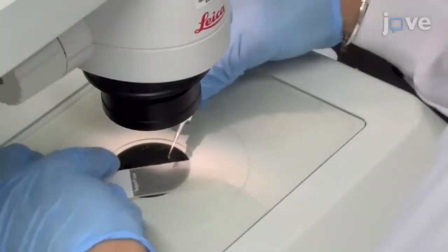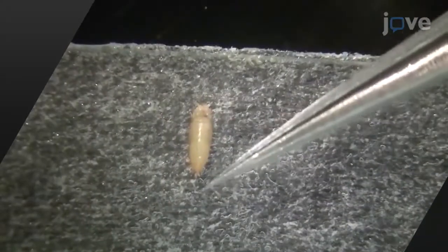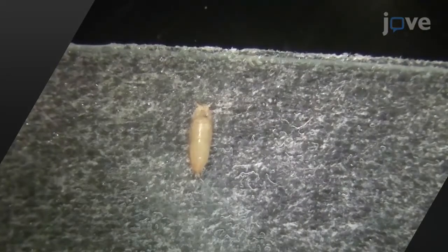Glue the ventral side of each pupa on a glass slide covered with double-sided sticky tape. Gently tap on the head spiracles and the dorsal surface of the pupa with the tips of the forceps to assure the adhesion of the pupal case to the tape.